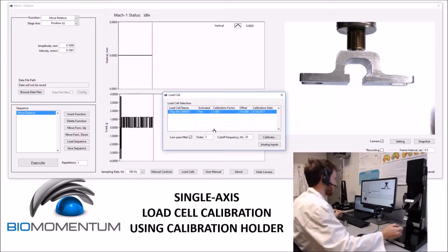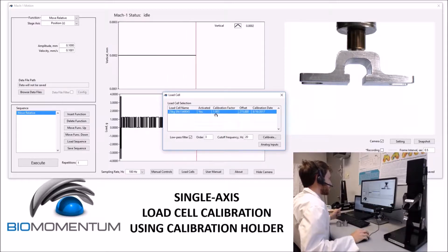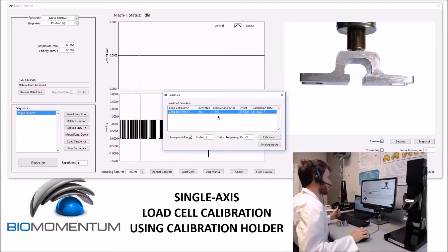The load cell is now calibrated. The calibration factor is always supposed to be within 5% of 1.00, so between 0.95 and 1.05.